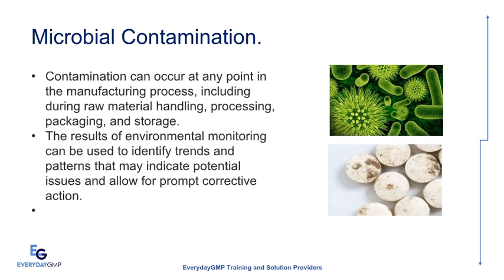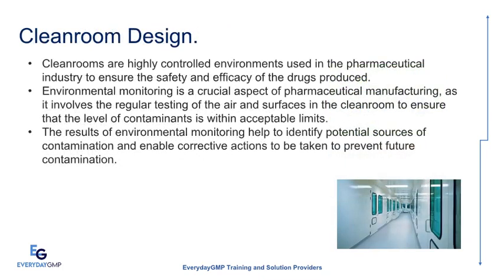Contamination can occur at any point in the manufacturing process, including during raw material handling, processing, packaging, and storage. The results of environmental monitoring can be used to identify trends and patterns that may indicate potential issues and allow for prompt corrective action. Another aspect is cleanroom design.